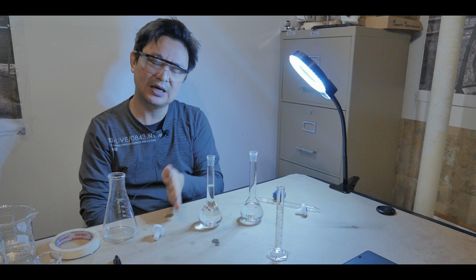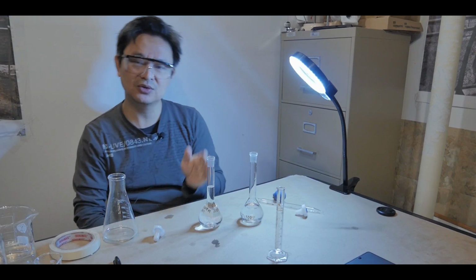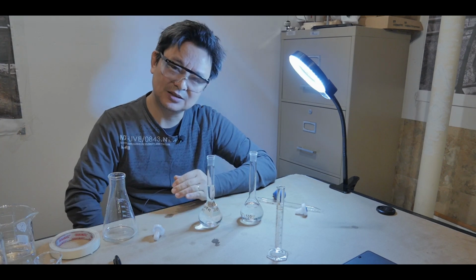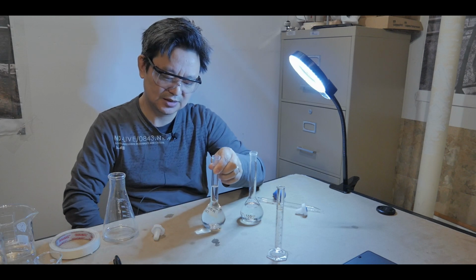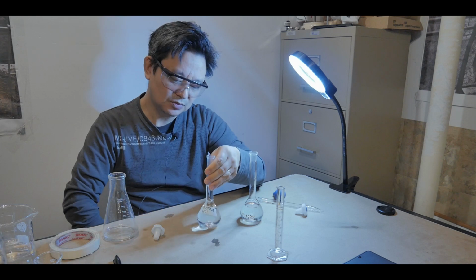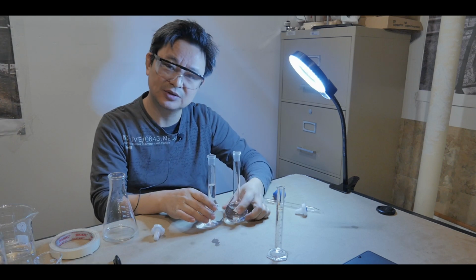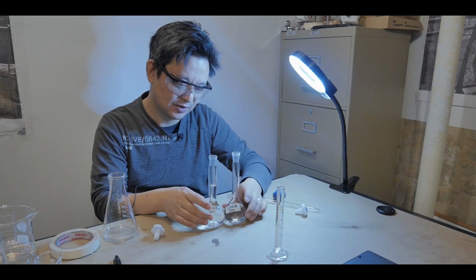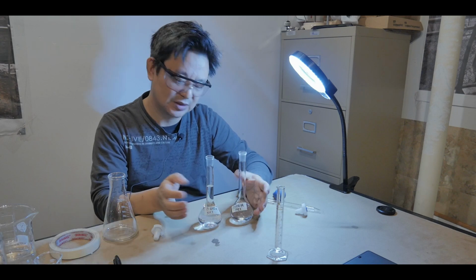And so you keep doing that if you want 0.001, 0.0001, and so on, and you're able to get as much diluted solution as you want using a very precise, accurate instrument like the volumetric flask. So very useful to have. I would get a couple of these for sure if you're doing serial dilution. I would recommend getting maybe 3 or 4, but I think for normal labs, 2 or 3 is good enough.